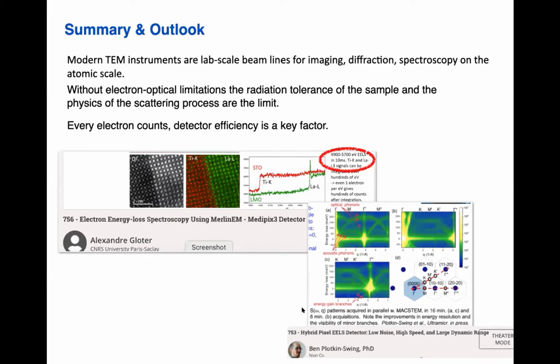Thank you very much for an interesting talk. And now there are two questions. The first one, I will read it. As I knew from literature, it's hard to deal with the most unstable phases of 2D layer materials like 1T, 3R. Is it possible to do imaging of these unstable phases of 2D materials using HRTEM, high resolution TEM?